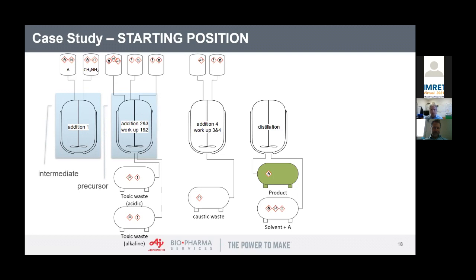And with the knowledge that the precursor that we're making in this one can explode when it's heated above 150 degrees, you really want to avoid everything near 100 degrees already. And the final addition is used to have the in situ diazomethane generation and cyclopropanation.